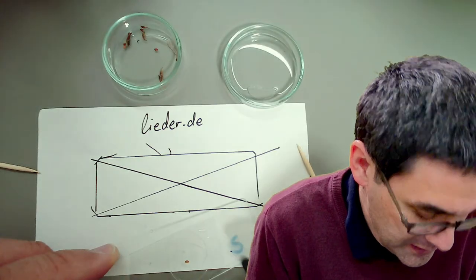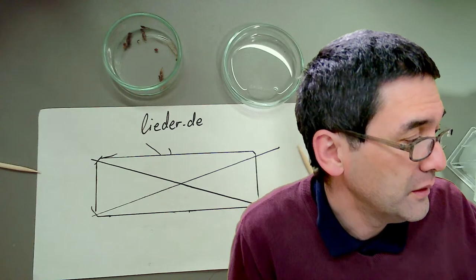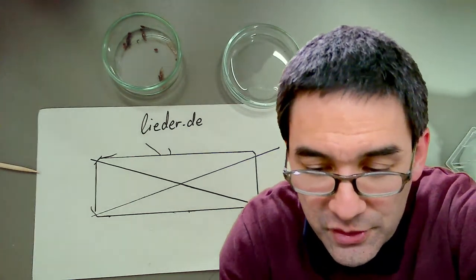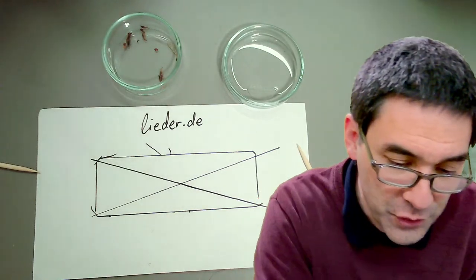So this one, just a second, I got to be careful. This one over here, I have to label this. This one was with soap. So I'm going to put an S on here. S is the one with soap, and the other one is not. I'm just going to keep it here and put them over there so that they can dry properly. I'm going to go back into the first one again.